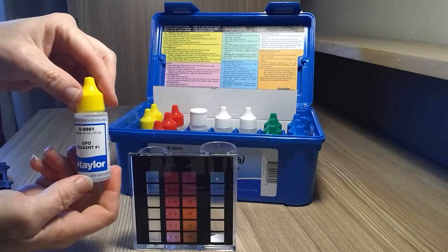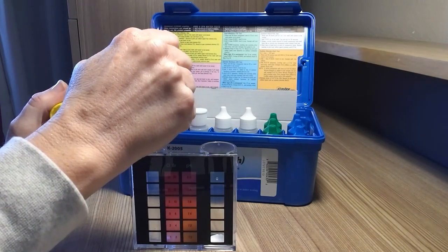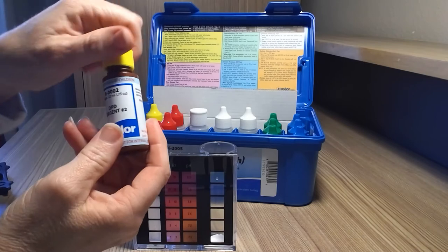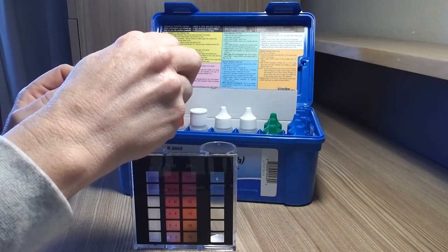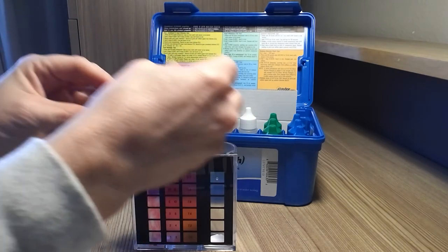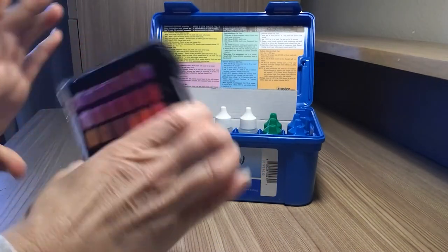First for your bromine, you're going to use R001 and put five droplets in. And then you're going to use R002 and also put five droplets of that in. You'll see the color kind of changing to a pink, and that's what you're looking for because we're going for the recommended range for bromine — between three to five parts per million.